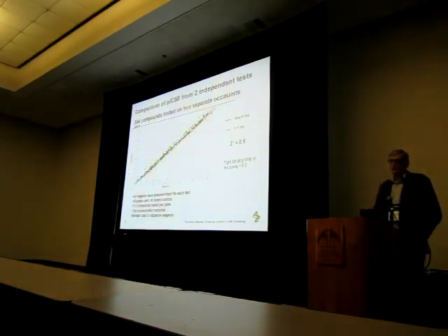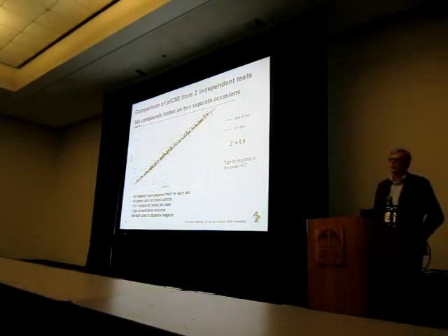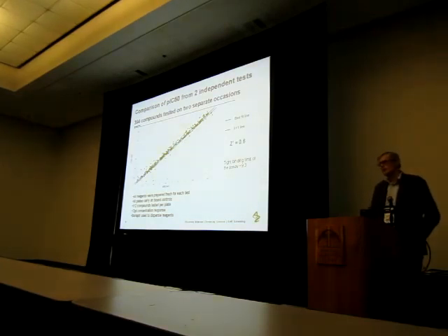So we don't run samples in duplicate at AstraZeneca. The reason for this is because we believe a better and more appropriate approach is to take the compounds and run them in 2 completely independent, separate tests. We do the compound dosing with an acoustic dispenser, so we're pretty confident that we've got a lot of accuracy in the way we dispense the compound.